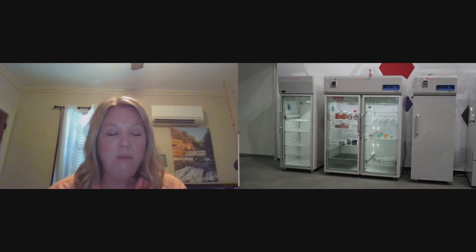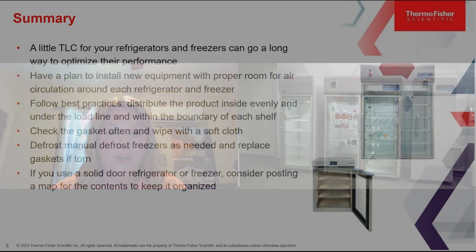Check the gaskets often and wipe with a soft cloth. Defrost manual defrost freezers as needed and replace gaskets if they are torn. If you use a solid door refrigerator or freezer, consider posting a map on the outside for the contents to keep it organized — that way you minimize door openings and keep frost to a minimum. That's not a bad idea for glass door units as well, to stay more organized and reduce the time when putting things back.